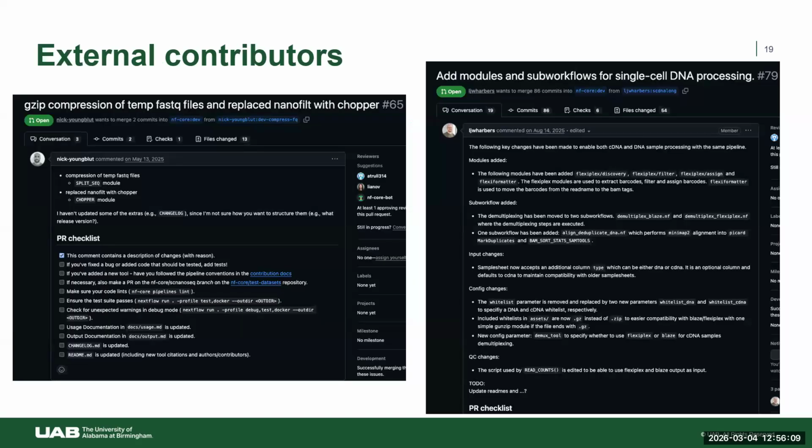And then external contributors. We've had external contributors to scnanoseq. This is a couple of examples. This PR, which is actually a PR that we do want to focus on in the hackathon if the GPU plan does not go as planned, I should say. We want to implement this PR because what it's doing is helping with file compression.